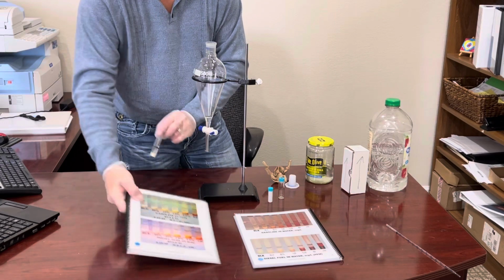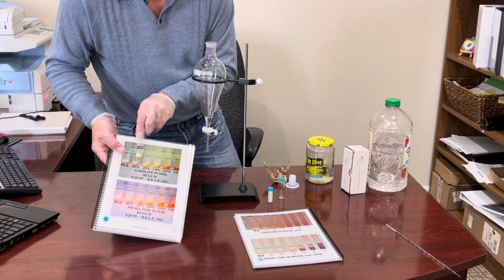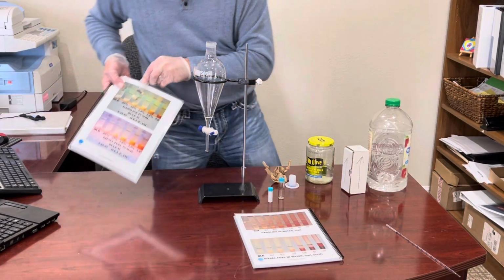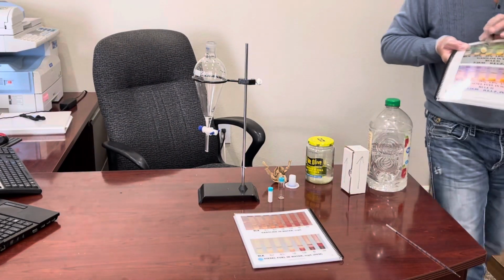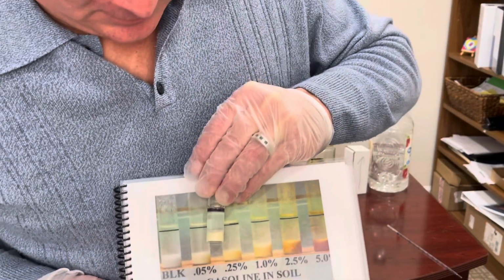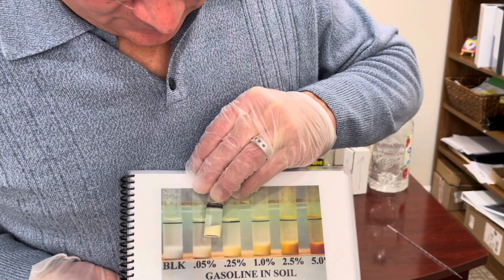You know, does it work? Yes. So now that the color is more fully developed, we can kind of see, and I'll bring it over there so you can see it closer. It's actually probably a little bit higher than that 0.05, or maybe it's right in it.